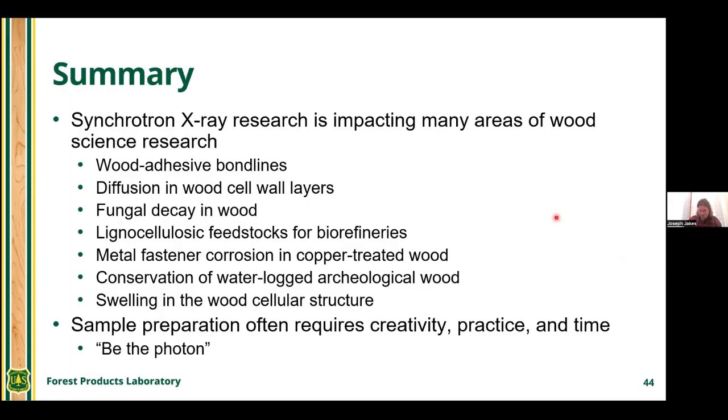And also when you're thinking about sample preparation in these humidity chambers, you always want to be thinking like the photon as well, because if the photon can't get to your material, and if the photon can't get to the detector, then you can't really do experiments. So you guys should be thinking about the path of the photons.